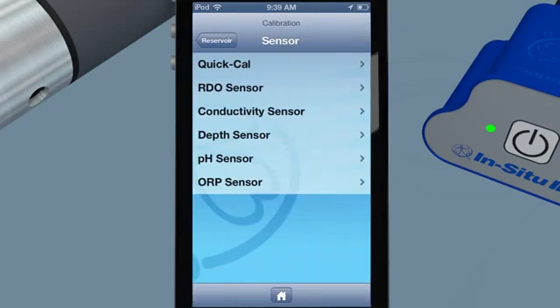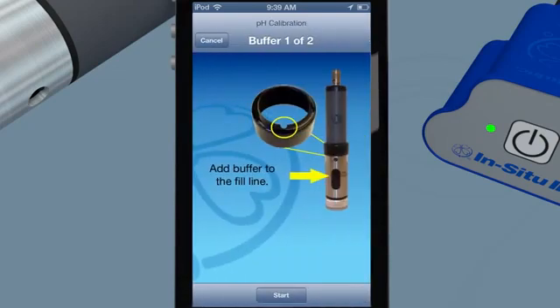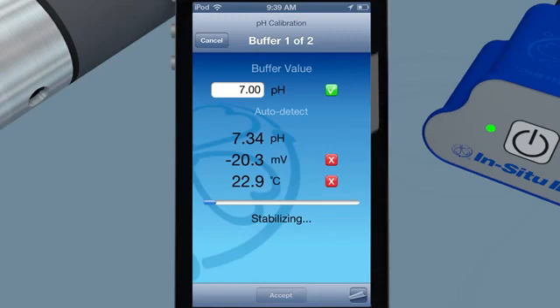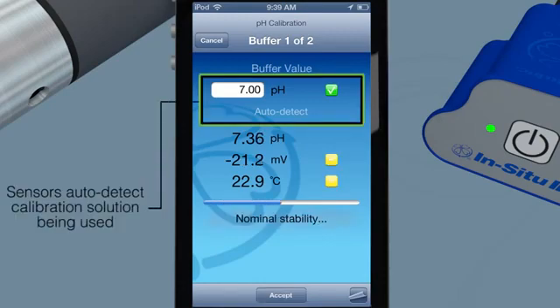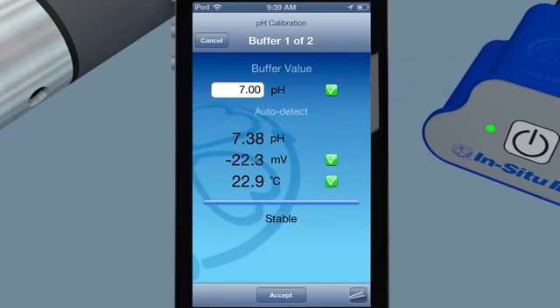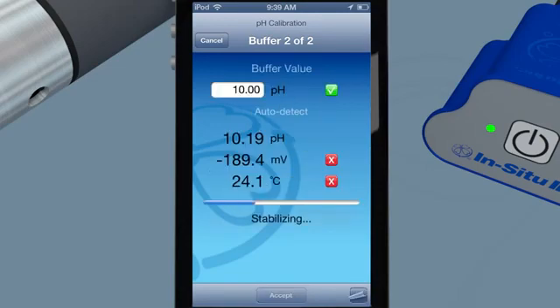Calibrate sensors quickly and easily. Smart sensors automatically recognize calibration solutions and calculate temperature-compensated calibration values that are stored within each sensor. Red, yellow, and green visual indicators show calibration stability stages. Easily understand sensor performance with automatic sensor diagnostics, data quality indicators, and calibration reports.